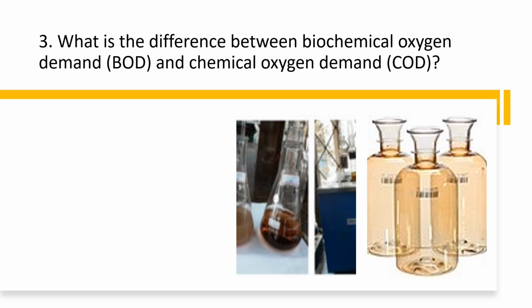Third question, and a very important question, is what is the difference between BOD and COD? Remember, first thing is BOD stands for biochemical oxygen demand. Many students say BOD as biological oxygen demand. No, it is biochemical oxygen demand. BOD is the measure of the oxygen required by the microorganisms.